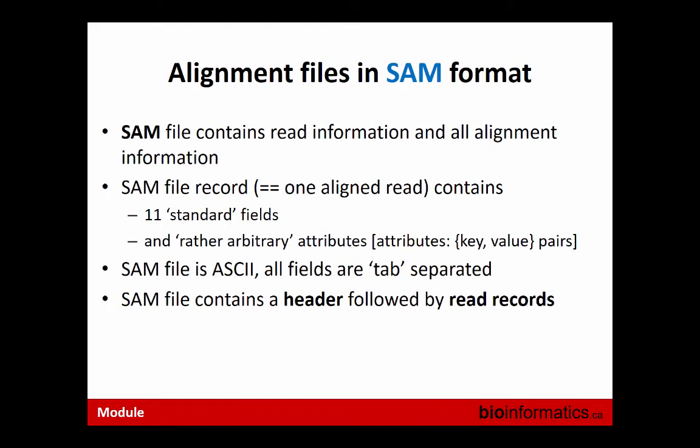If you want to trim your data, like let's say 100 bases to 75, how do you decide how to trim it? That's a good question. I guess, from Martin's talk, you just look at your QC. You see that your read, probably from position 5 to position something, has the best quality. That would be your best, but you will be a little bit biased. You need to decide. When students ask us the same question, typically, if you want to be really rigorous, you try several times. You try at the beginning, then position 10, position 20. You repeat your experiment and you see where data looks better. But you typically don't have time for that, and you might not learn much. But this would be the really honest answer to your question: try different ones and see what happens.